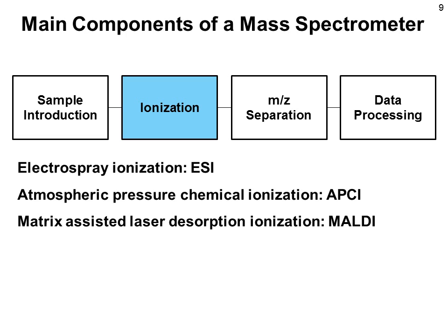Matrix-assisted laser desorption ionization is another soft ionization method with which macromolecules can be ionized. It is principally different from the other two, as ions are generated from the solid phase and not from the liquid phase. We will also hear more about this ionization technique later on.